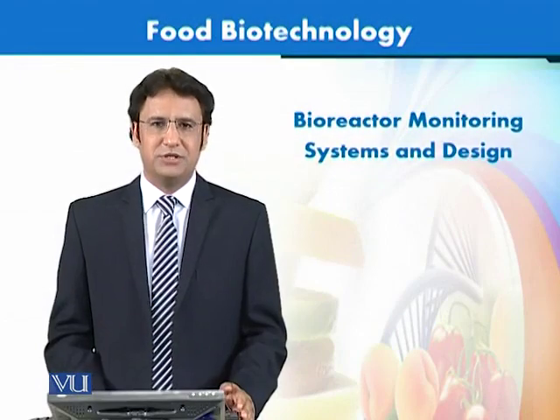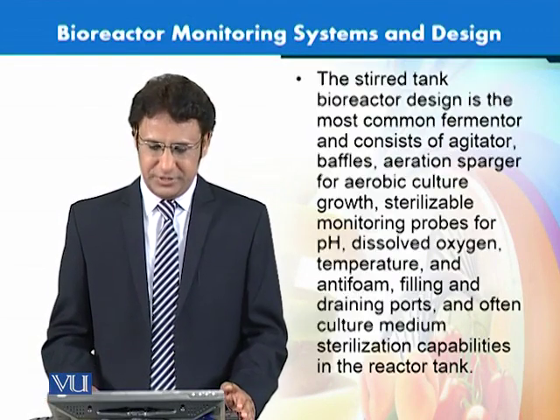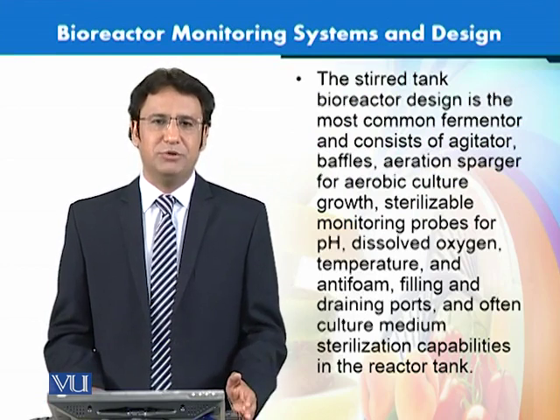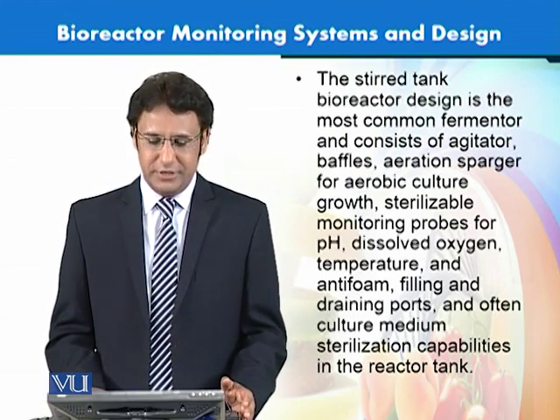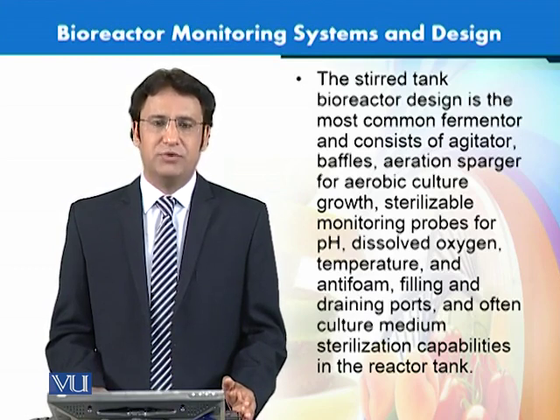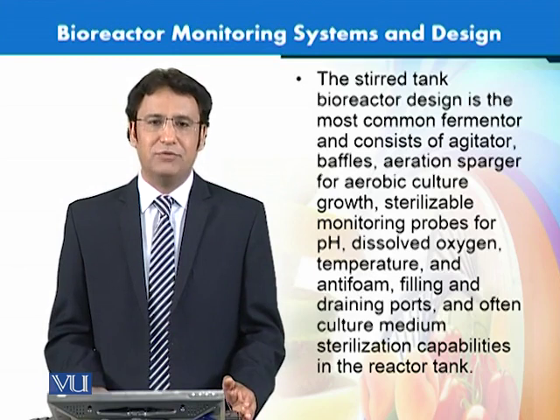Now let's talk about the bioreactor monitoring systems and designs. So let's look at different methods that can be used. One of the methods to monitor these bioreactors is the stirred tank bioreactor. It is the most common form of fermenter. This is used commercially.